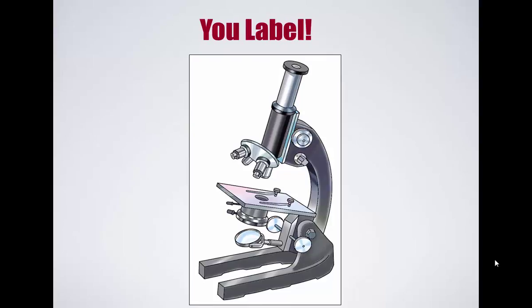Alright, so yesterday we talked about the parts of the compound microscope, and today we will be reviewing those. This is one type of compound microscope, similar to the one we saw in our diagram yesterday. It will be similar to the one on your quiz Monday, in which you're going to have to label the different parts of this microscope.